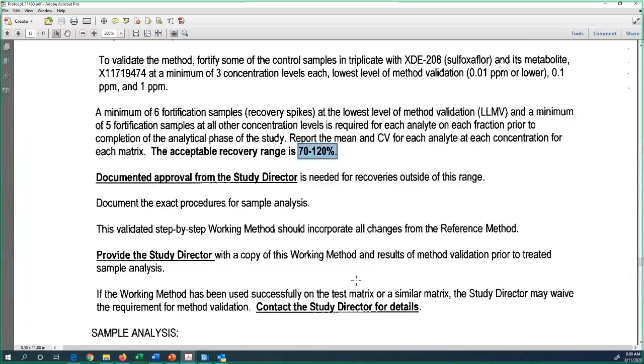Your recovery is low. But for some compounds, the matrix may help because it's easy to ionize, and the ions can be transferred to your sample as well. This is called ionization enhancement. This will give you consistently 130 or 140% recovery. It's not just one spike, it's consistently high. So that's matrix enhancement. It happens all the time.